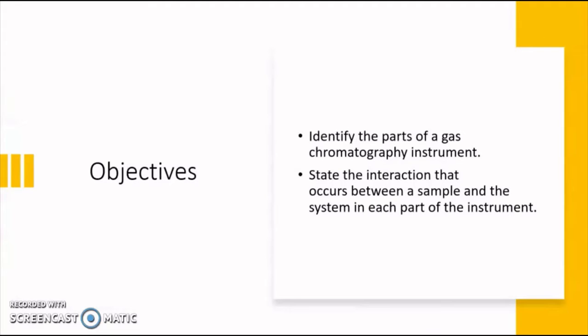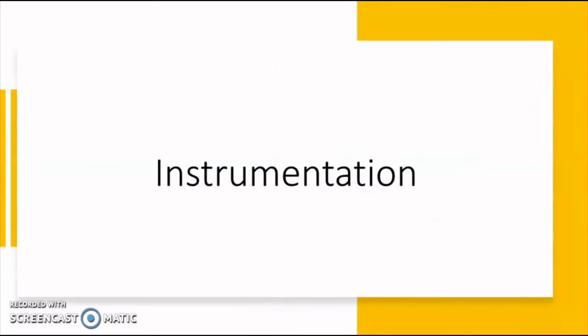In this lesson, we're going to learn about the components of the GC instrument, and we'll learn about the sample interactions that occur with each component.